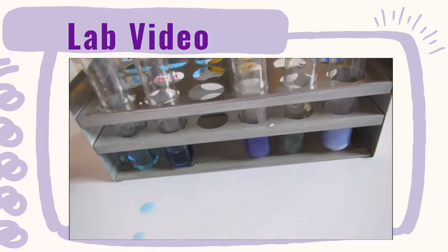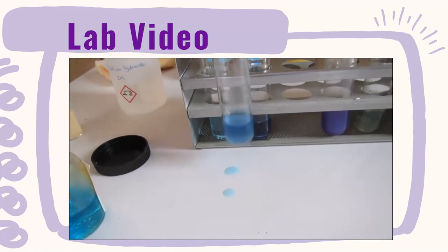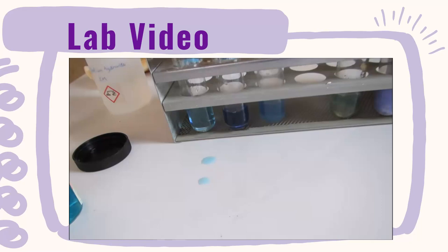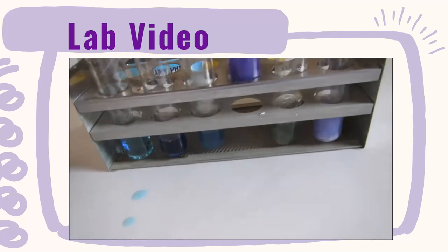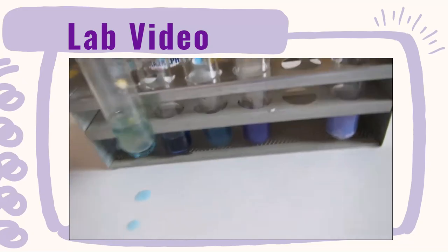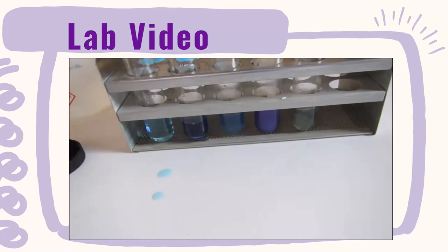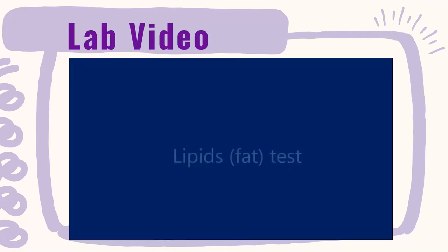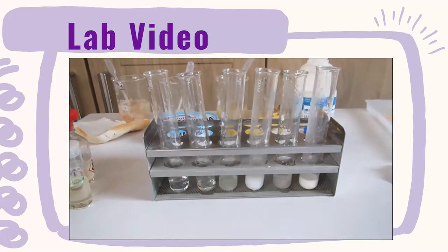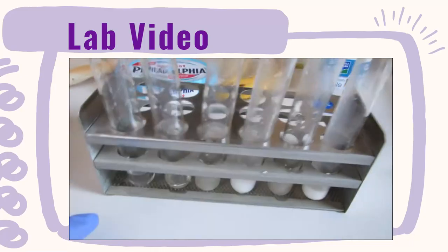To the milk, I'm just going to give it a little bit of a mix. And with all of these, you're going to want to decide, so firstly, the bread, is it more like the positive or the negative? For the cheese spread, more like the negative or the positive? For the banana, more like the negative or the positive? And for the milk, more like the negative or the positive?